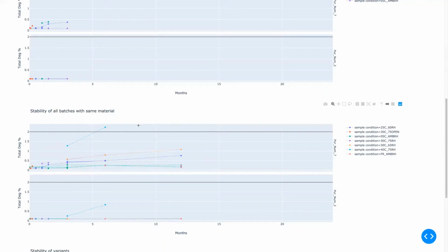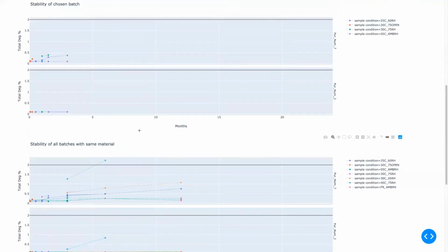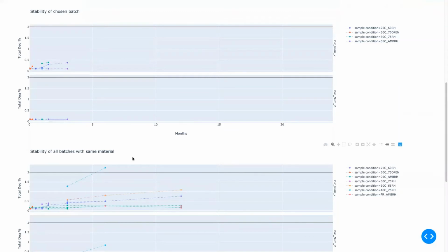So great, this is a good starting point, but it gets much more powerful when we can actually go behind just our LIMS data and actually integrate other systems, such as our SAP system or our ELN. And then you have access to longer histories of the projects and also to more detailed information on the product properties. And then you can better determine the root cause of a deviation, such as this one. And what's way more exciting in the future is that you can actually use ML to learn from all of this data what risks actually exist and flag them ahead of time.